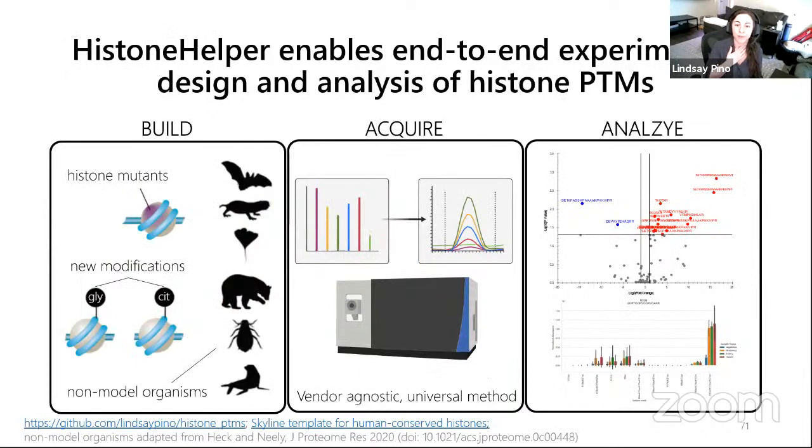So this has been a really fun project to push some of the limits of doing good quantification in histone PTMs and PTM work that has really been enabled using all of the tools in Skyline, and even coming up with some hacks for how we can use Skyline tools in a slightly different way than they might have been intended. But the flexibility of the software makes it really easy, once you're familiar with it, to figure out ways to adapt it to what exactly you need.